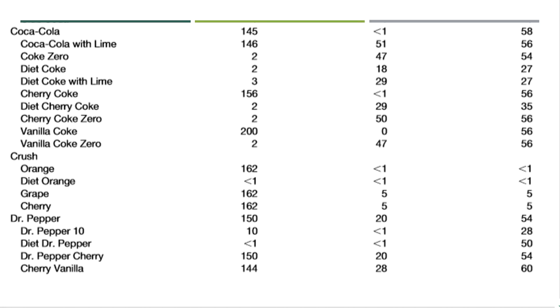Next, what you're seeing now is Coca-Cola up at the top. And if you look at Coke, it does have phosphate in it. This meets the criteria, though, right? It is a carbonated beverage, and this carbonated beverage really does have a higher level of phosphate, and it's dark.